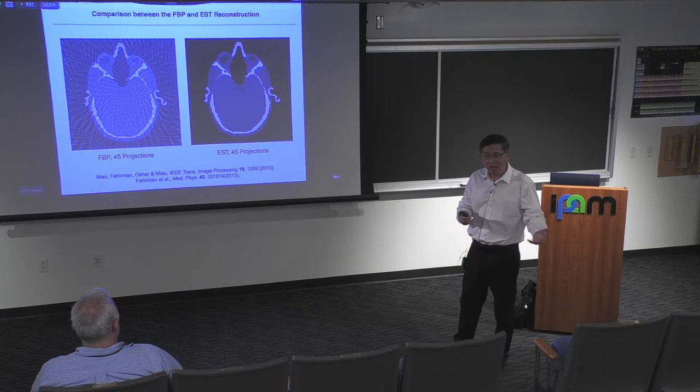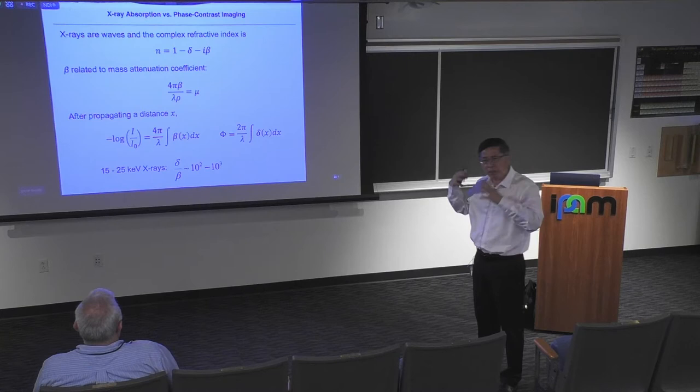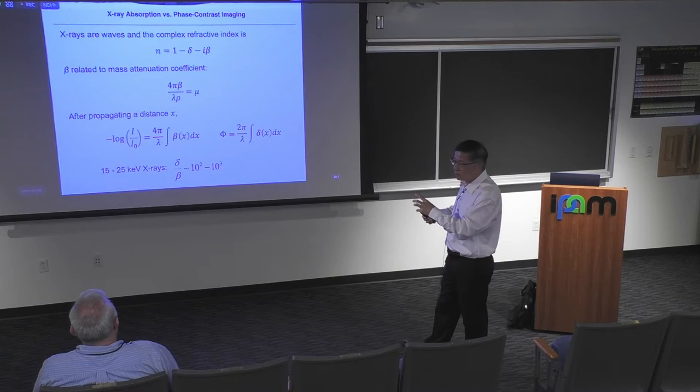You can think of filtered back projection as just the first iteration, just going back. And if iterative, you can always do better. The TV definitely helped this. OK, that's kind of the history. My group continues to collaborate with Stan's group, and with postdocs, they continue working with us. And I'm going to also show a future direction for medical CT scans.